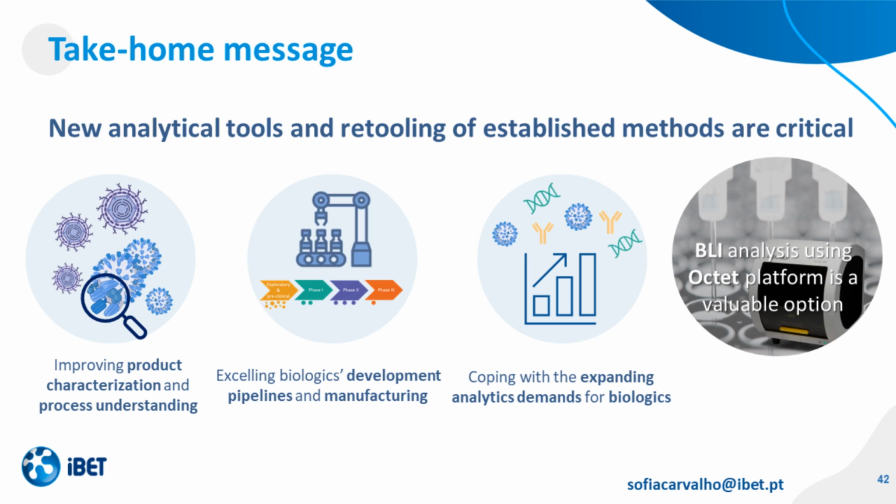Hi, so yes, the Octet is a technique that we can use to develop stability indicating methods. Even though we didn't show any results on that today, it's already established, for example, for influenza molecules as well. So we can, for instance, inactivate the antigen of the influenza virus or use other forms of denaturation, and then we can show that this denatured form does not bind to the immobilized ligand. So yes.